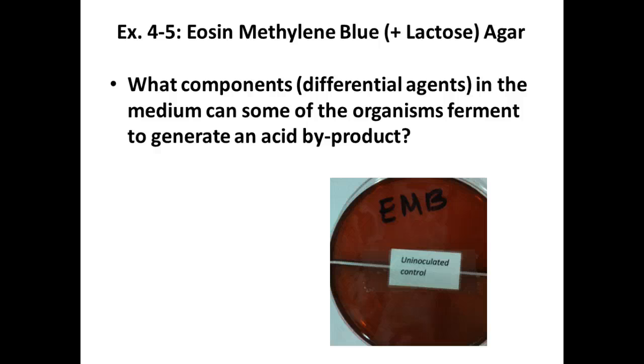So we've got dyes that kill gram-positives, so if you have a gram-negative, you should have seen growth on this plate, right? And especially if I didn't give you a blood agar plate today, you probably have really good growth, right? Remember, again, this is not a be-all, end-all. Some gram-positives can grow, although it's rare.